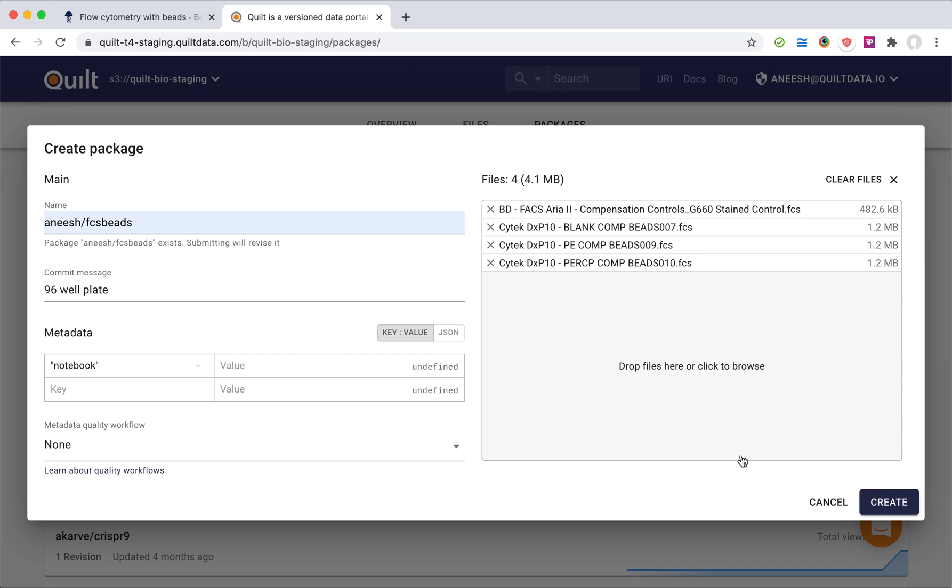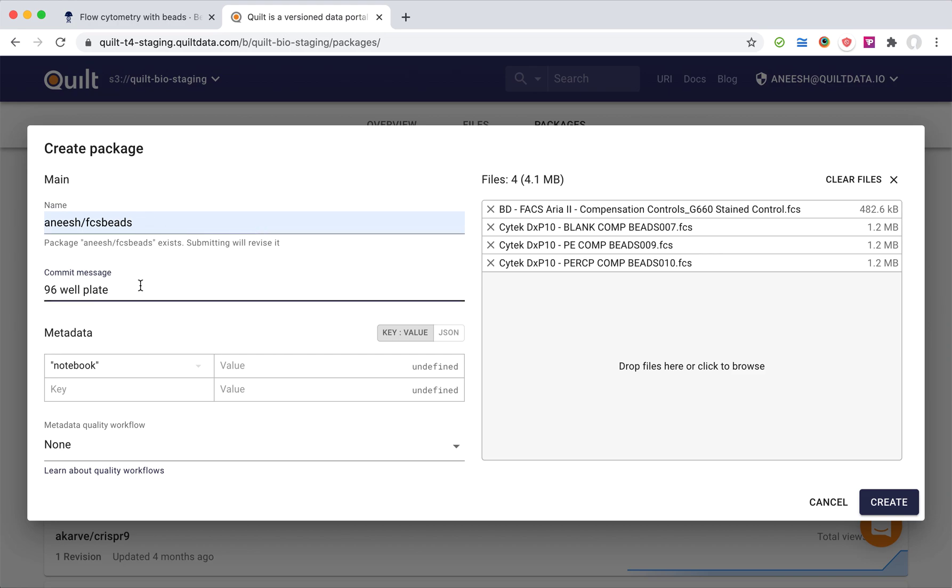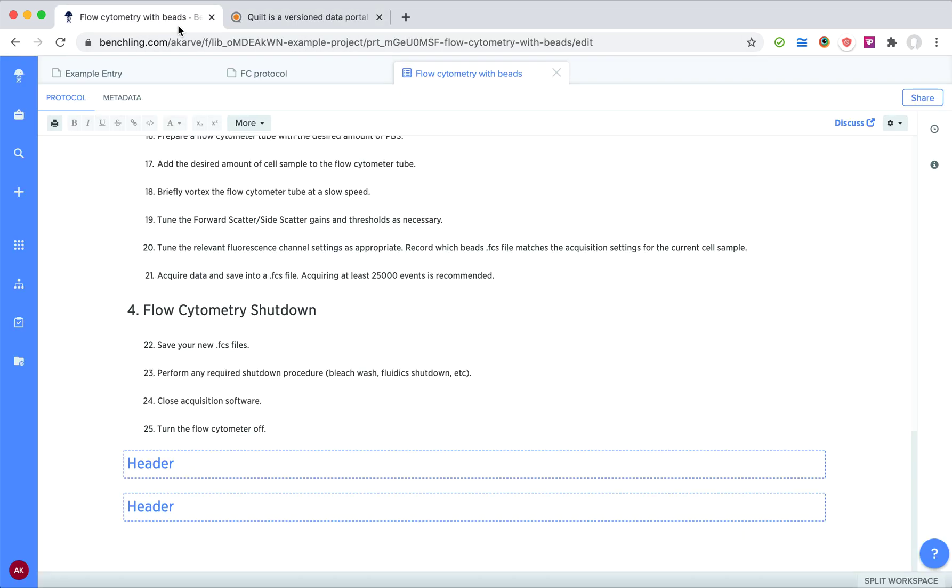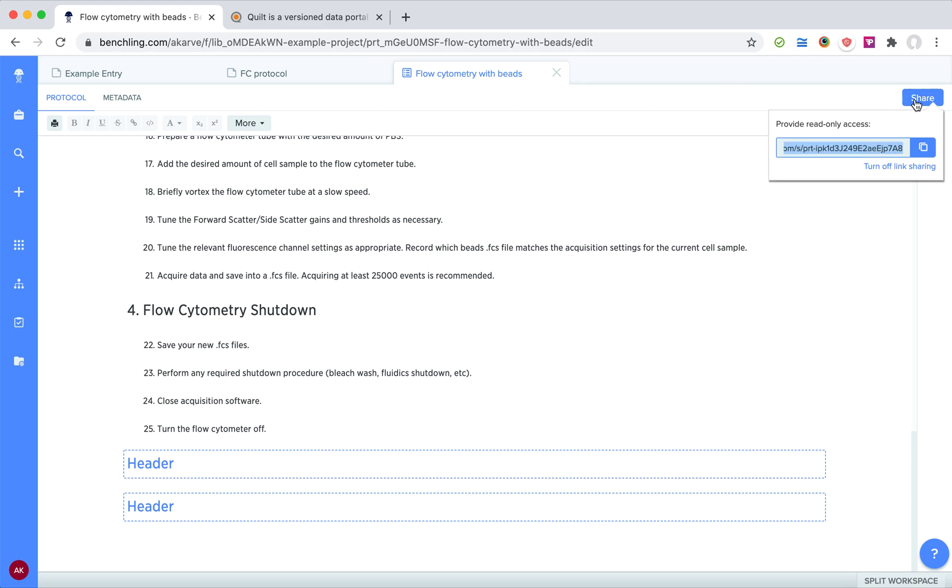I'm just going to make a name for the dataset, so FCS beads, and I just made a commit message here that's a 96 well plate. And really what I'd like to do is link this dataset to the Benchling notebook that produced it.